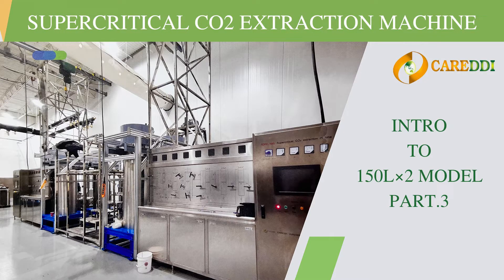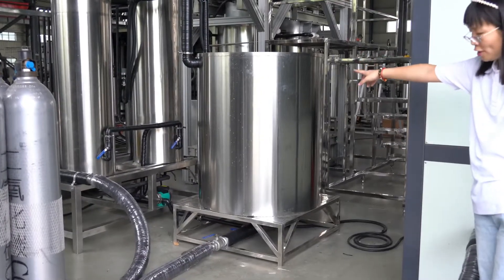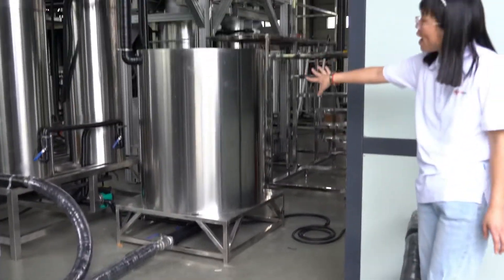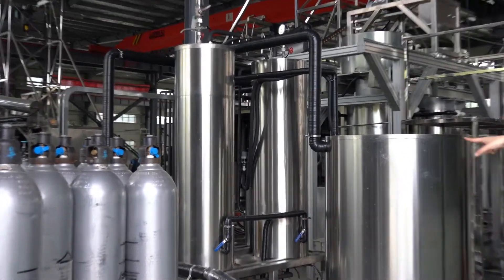Welcome back to our part 3 video. Let's continue with the cold water tank. Here is the cold water tank. It works together with the chiller to perform the cooling function. There are two black pipes connecting the chiller, cold water tank, and carbon dioxide storage tank. There is some cold water inside.